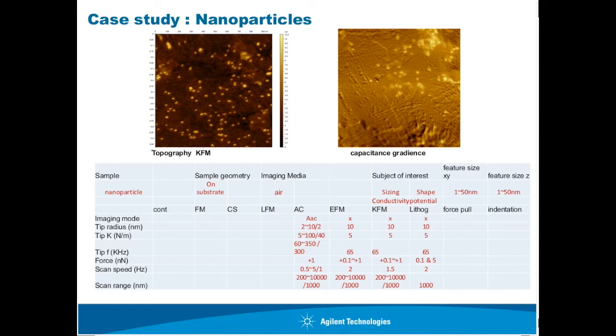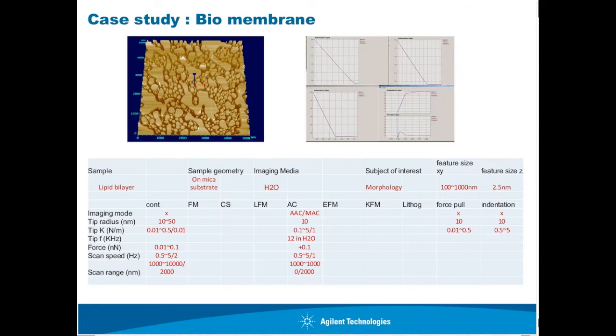The question is, we work with nanovesicles smaller than 100 nanometers. We would like to absorb them on mica and image with AFM in liquid. What tip would be the best for this type of sample? This type of sample is very similar to, let's see, which slide is this? Oh, yeah, here it is. I would say use a relatively blunt tip, and if you want to use AC mode, I would say medium to stiff, 1 newton per meter.